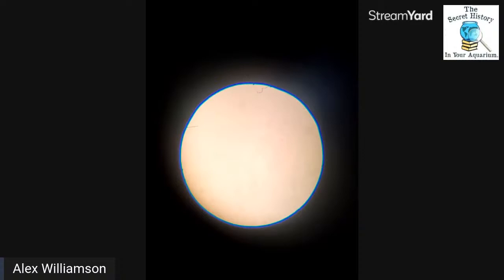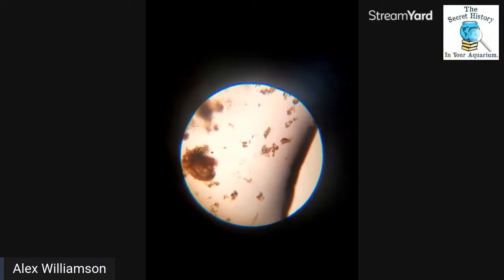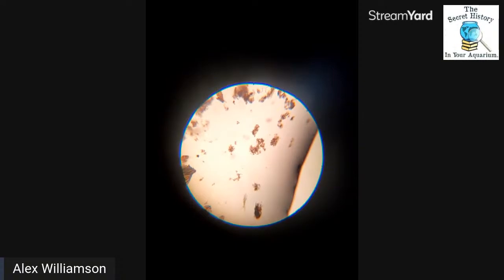And then we'll take a look at, let's see here. I'm trying to get some of the debris in there. And we'll look at increasingly less, largely biodiverse anyways. Like the biodiversity outside, you could get anything from tardigrades to stentors to amoebas to lots of paramecium type things, lots of little crustaceans, micro crustaceans. So, all right, we got a couple drops now that we can work with.